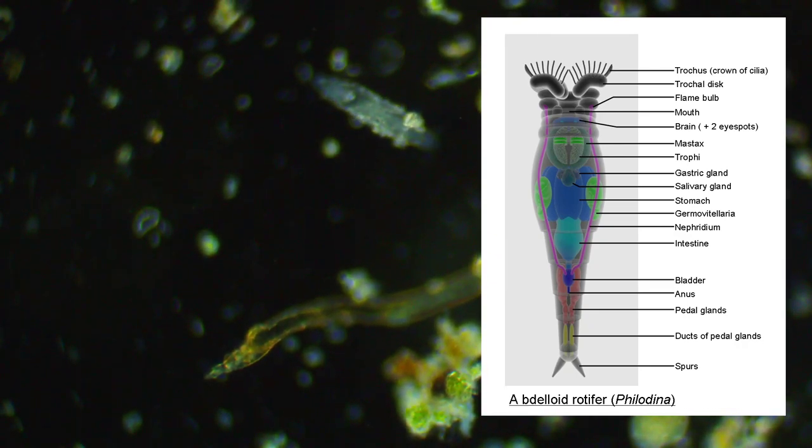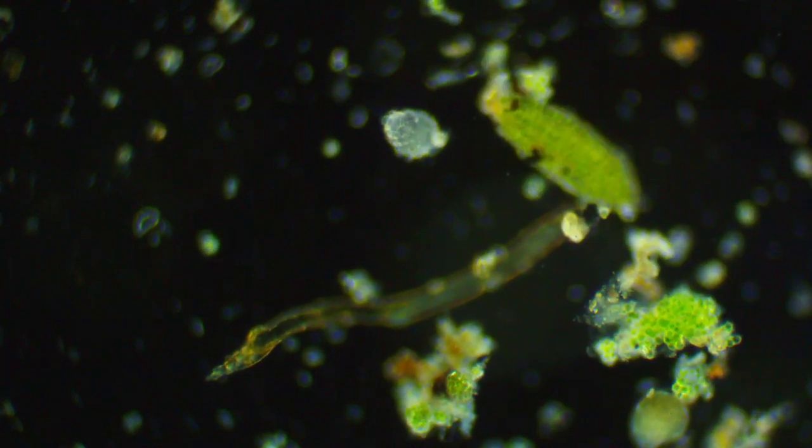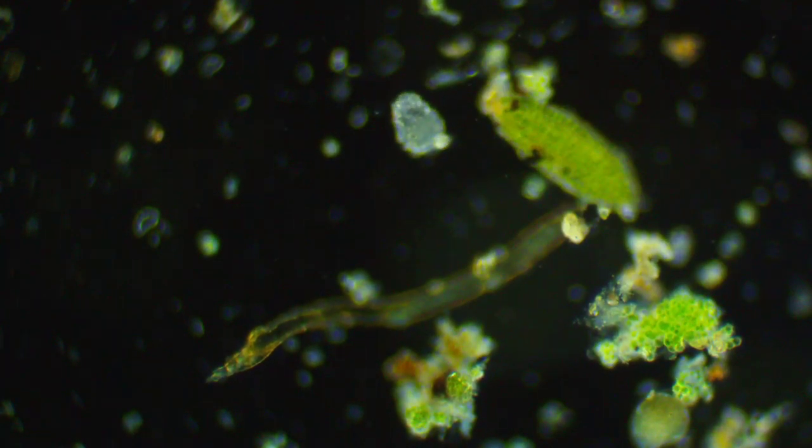So let me turn this image off here. Go back out to the first objective.